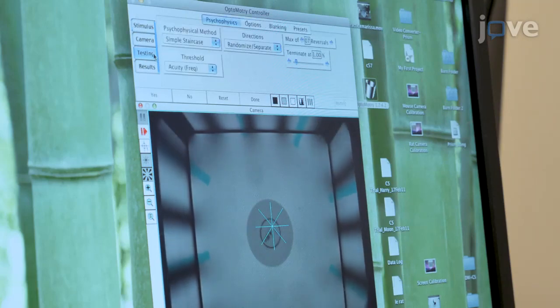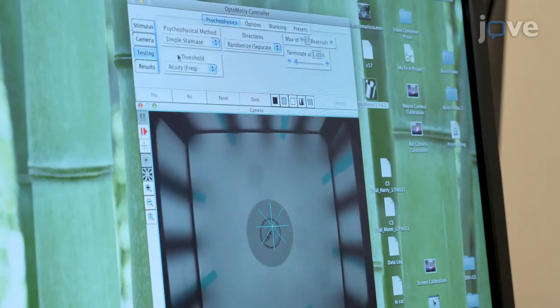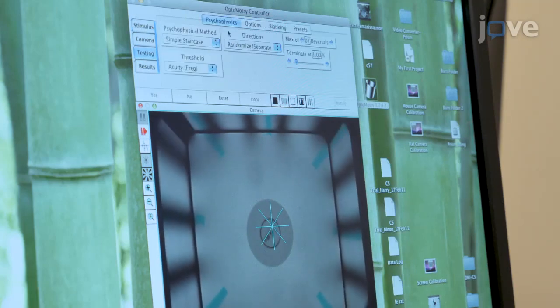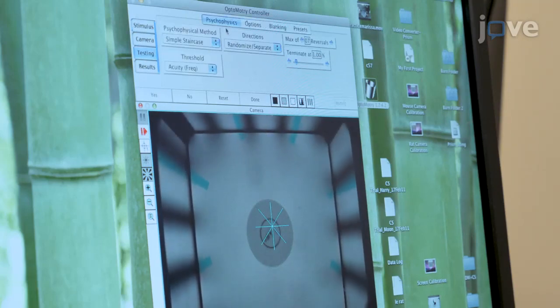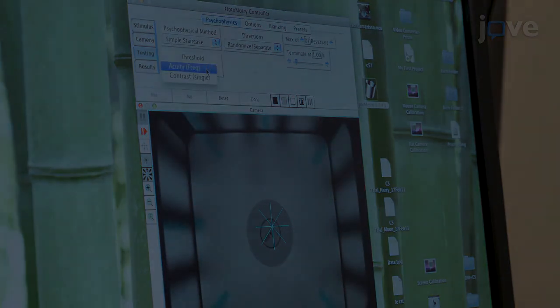Under the Testing tab, click the Psychophysics tab. To measure spatial frequency, under Threshold, select Frequency.